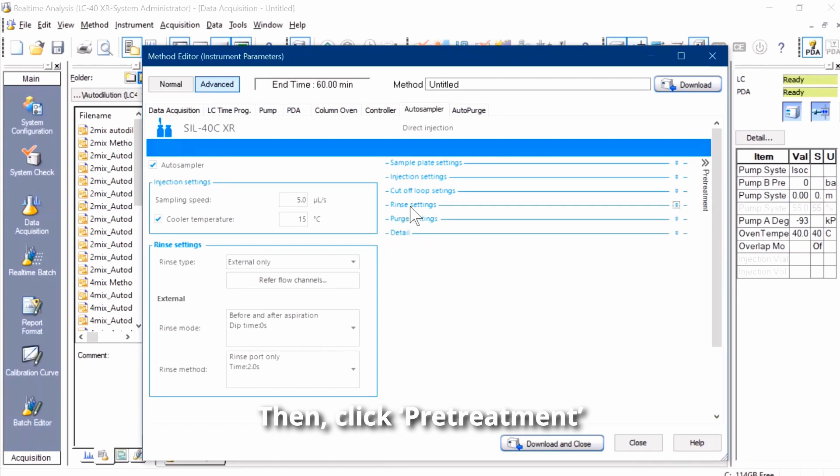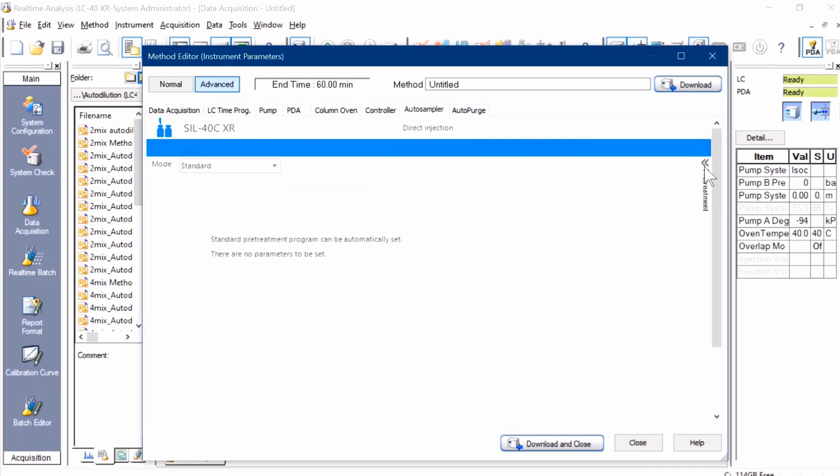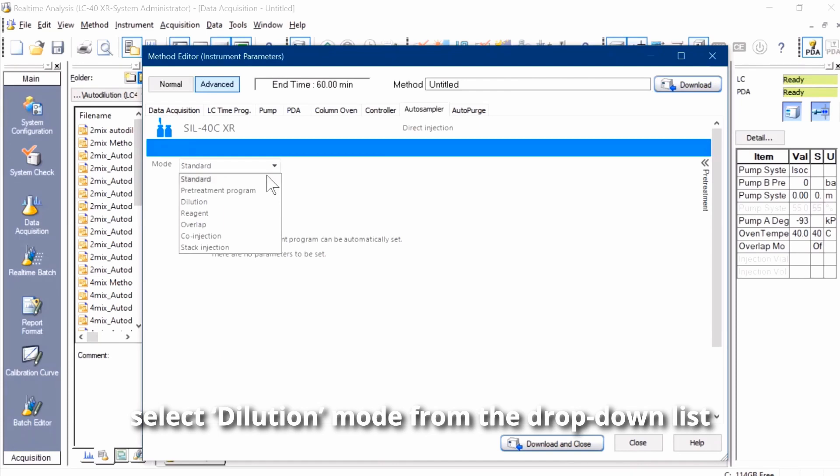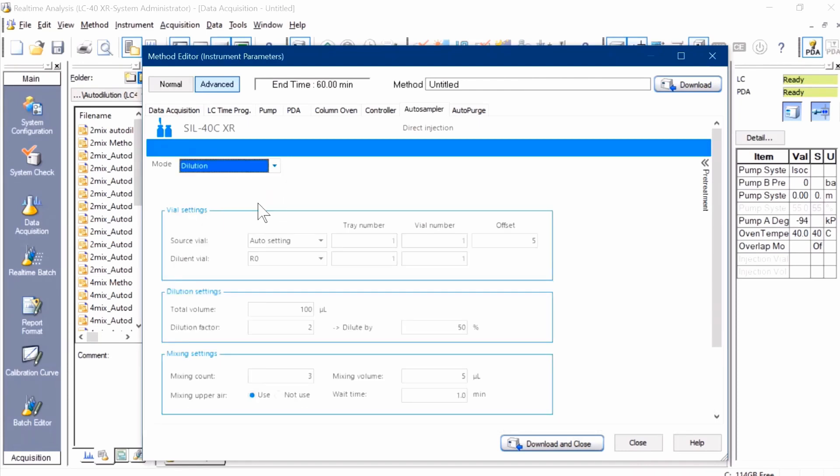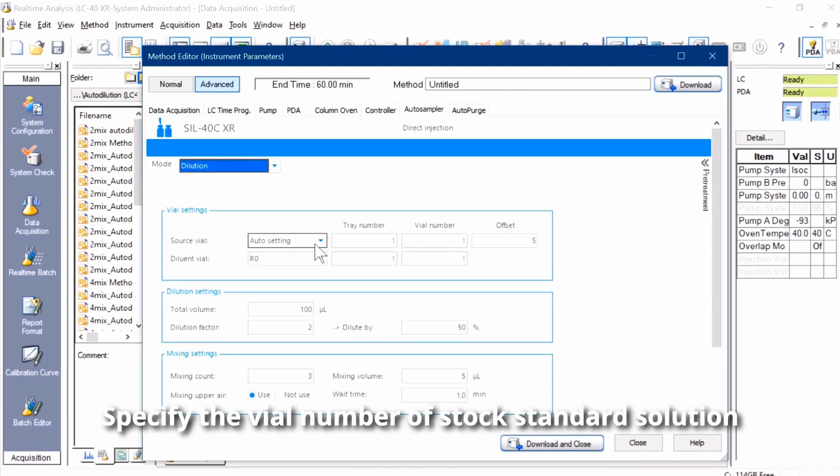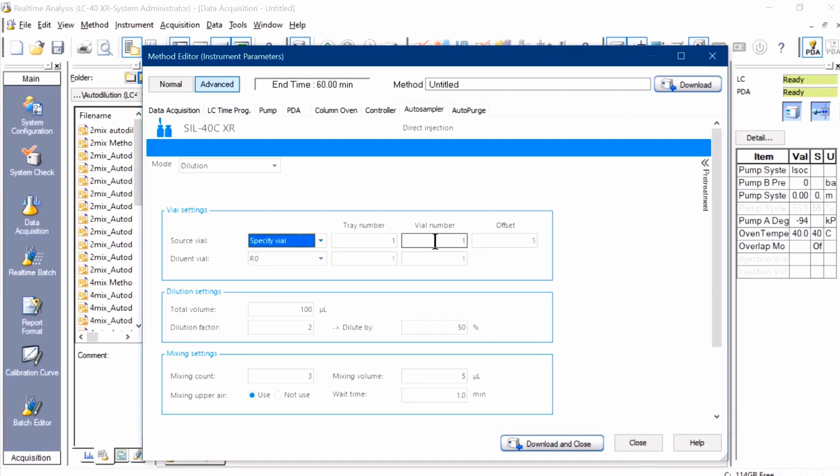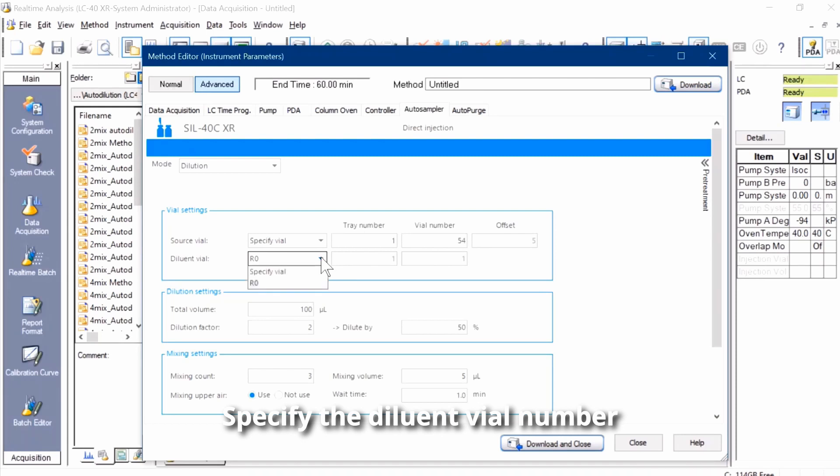Then click Pre-treatment, select dilution mode from the drop-down list. Specify the vial number of stock standard solution. Specify the diluent vial number.